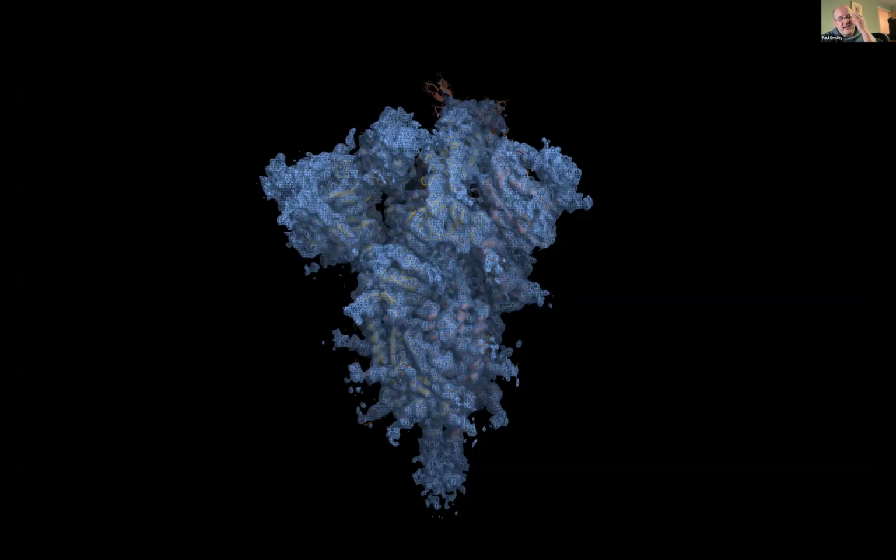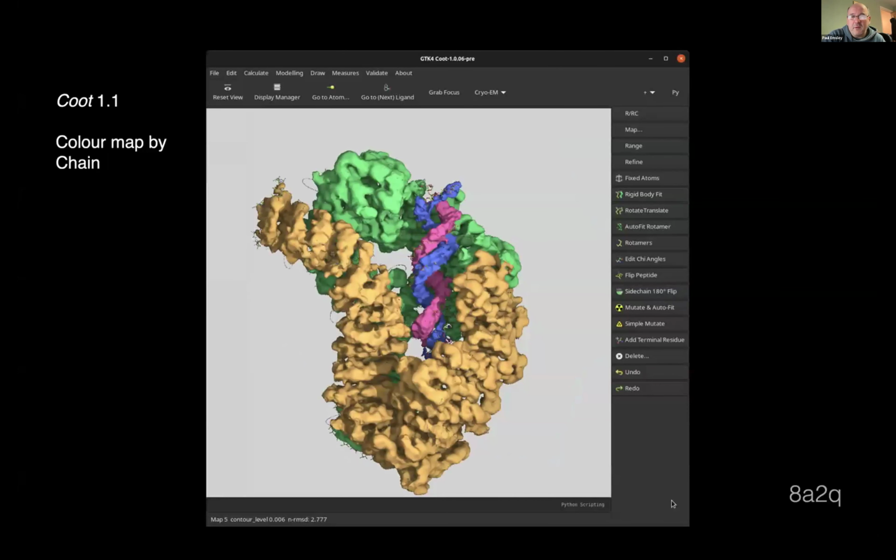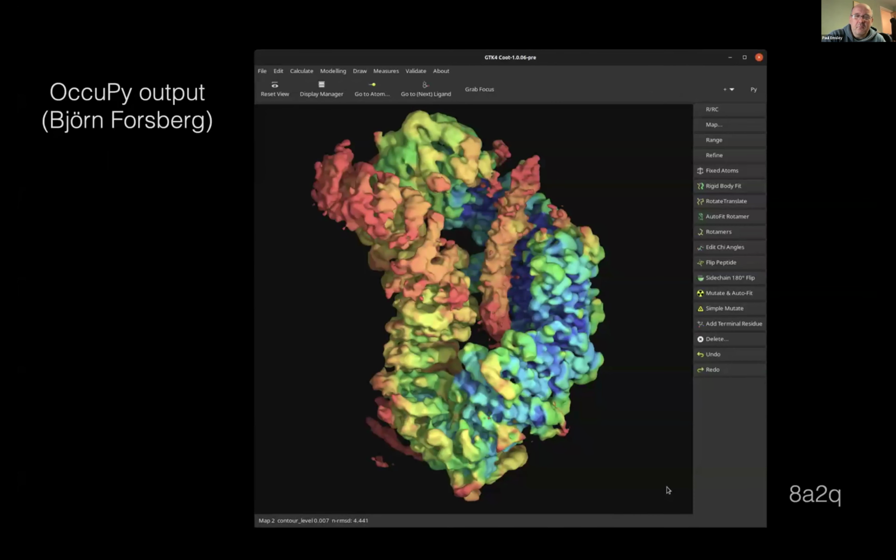Carbohydrates and spike protein, which you may be familiar with after all these years of seeing it. Other virus structures. We can color by chain, and we can have two maps, right? One for surfacing and the other one to provide some value, correlation coefficient, or occupancy or resolution. One might use those kinds of things for representing this kind of structure.